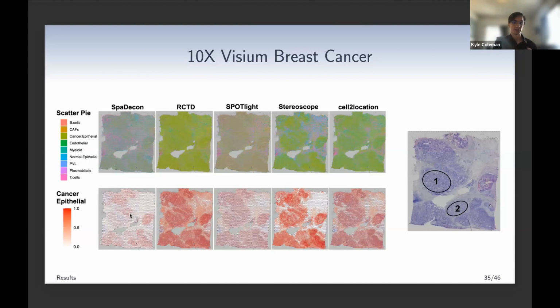The cells are much less densely populated and show quite a few differences in cell morphology. So it's quite possible that these actually aren't tumor regions at all, and SpaDecon was able to avoid misclassifying them as such because of its use of histology in cell type deconvolution. So this is, again, very promising for our method.